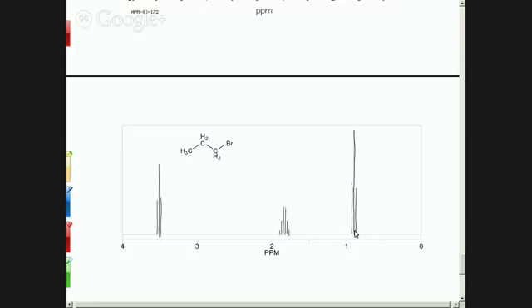So which group of hydrogens in that structure has 5 neighbors? None of them have 5 neighboring hydrogens? Like together, close. They don't have to be together. I mean, like together, there's 3 in there. The first carbon after this one? The next one. This one. Yeah. So these 2 hydrogens have 5 neighbors, 3 on this side and 2 on this side. You see that? So that means that those hydrogens must be represented by this peak. Okay, I get that.